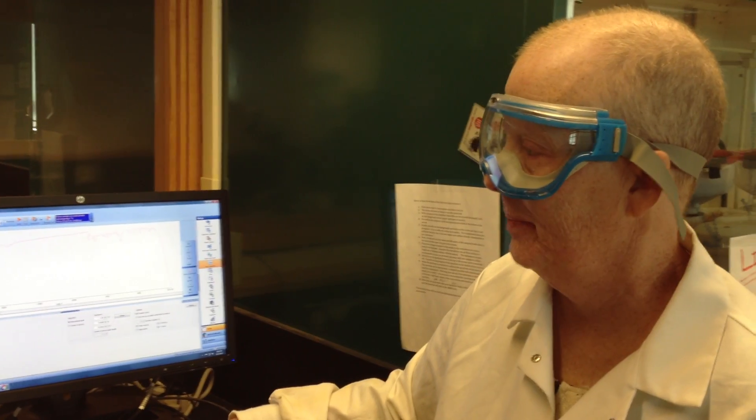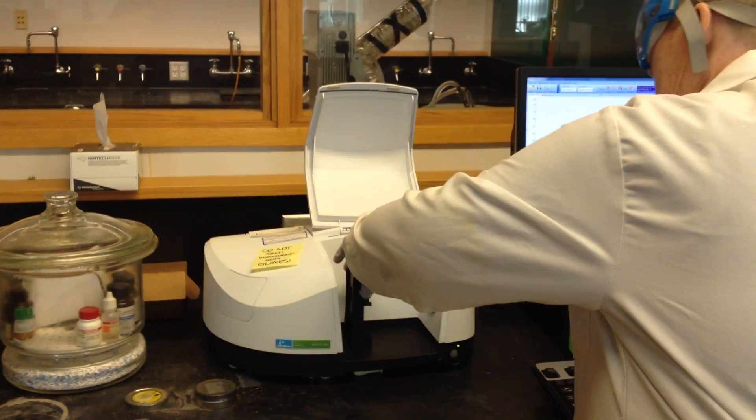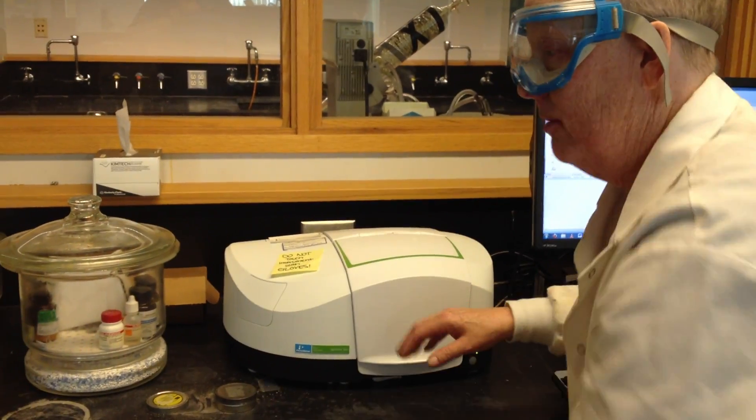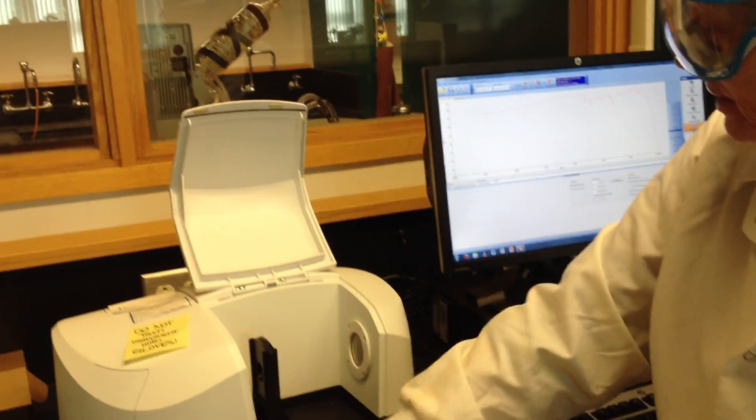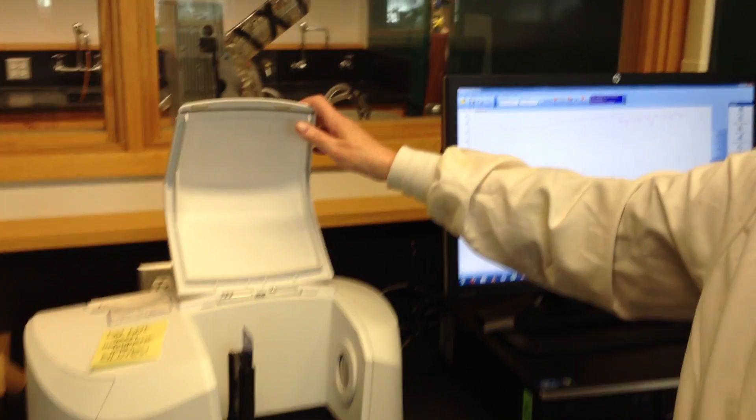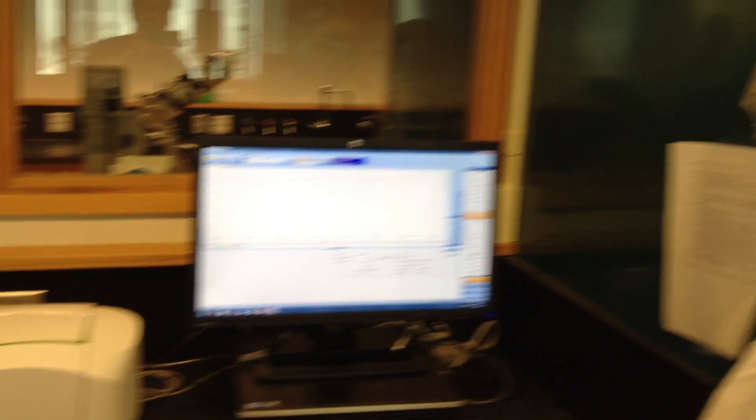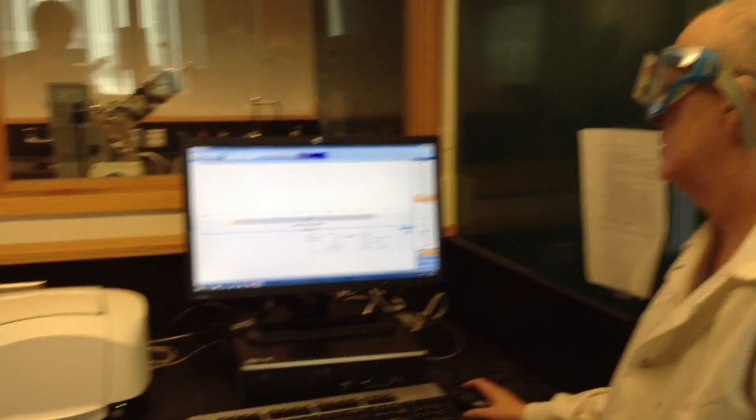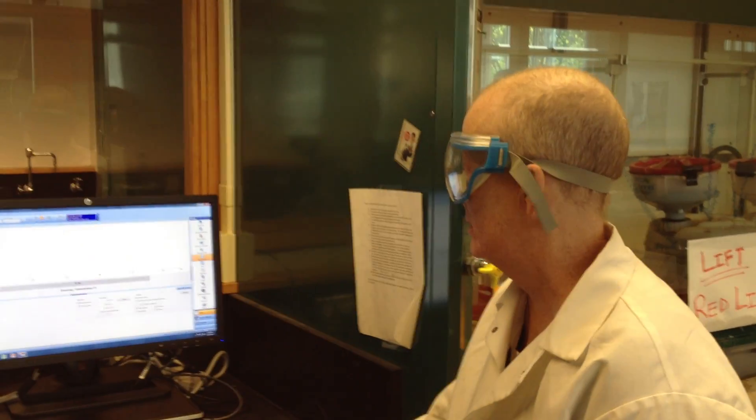For example, if I took this out, say I take this sample out, which I just ran. I'm pretty happy with that. But let's say I run, I'm just going to run a standard that's going to give a very strong spectrum. This is something that's going to give a very strong spectrum. This is just a standard we use. It's called polystyrene film. So say I ran this, and I just scanned this, for comparison's sake. Again, this goes very quickly. I just want to show you how you can manipulate the data a little bit.